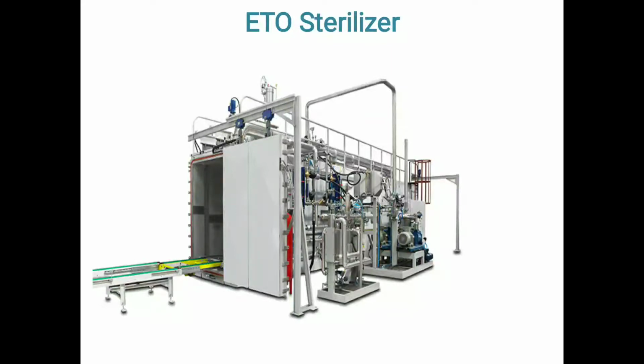Pre-sterilization conditioning involves sealing and evacuating the chamber and adjusting the temperature and pressure of the chamber. Then actual sterilization is carried out, which involves addition of ethylene oxide as a sterilant and maintaining an optimum operating pressure and temperature in the chamber. Then evacuation and air washing.